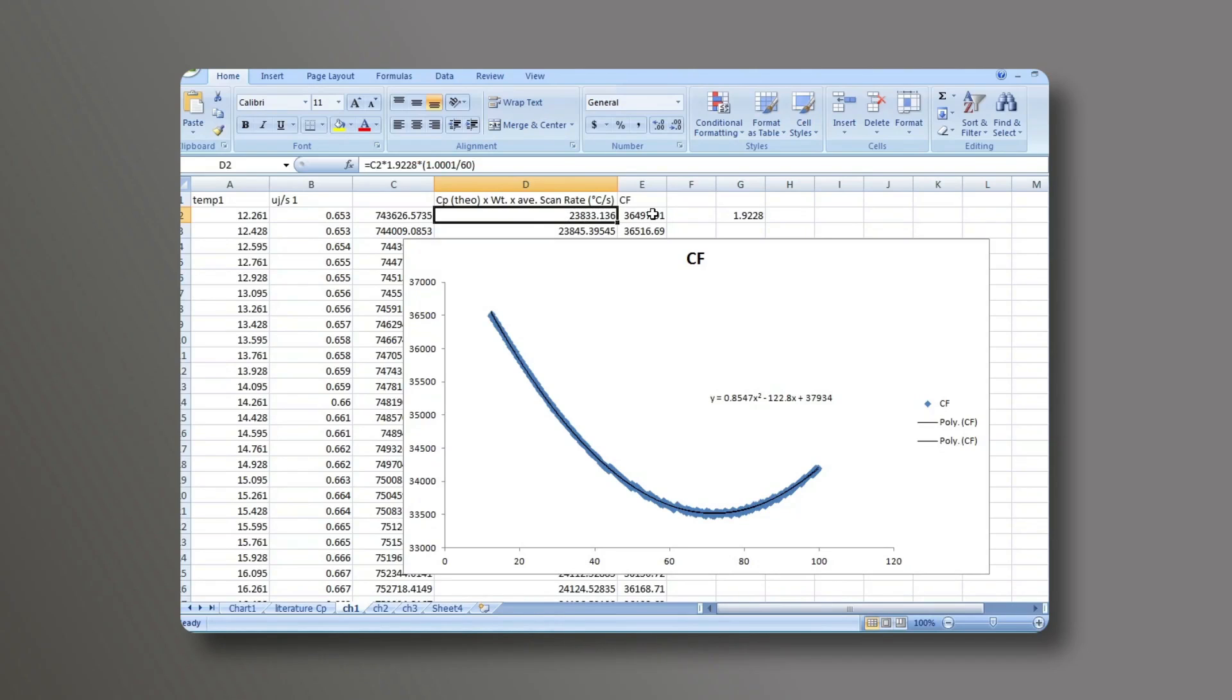The final column is the calibration factor. In this column, column D is divided by column B.